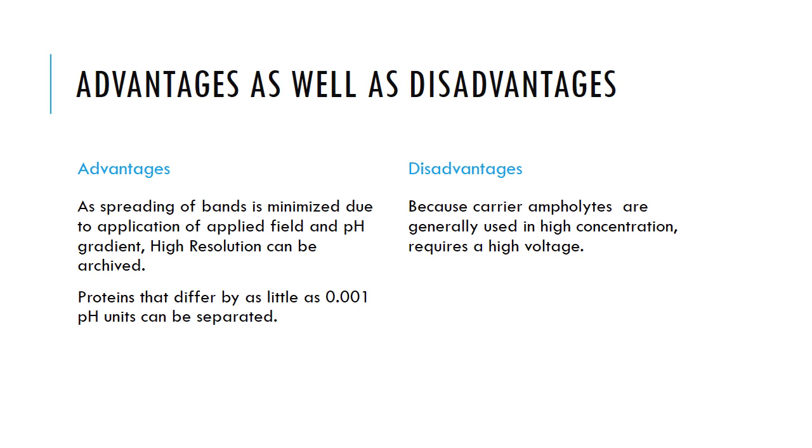One of the disadvantages is that the ampholytes are used in high concentrations. So in order for this method to be successful, we are expecting to use high voltage. Once the voltage is low, we are not expecting this method to be successful.